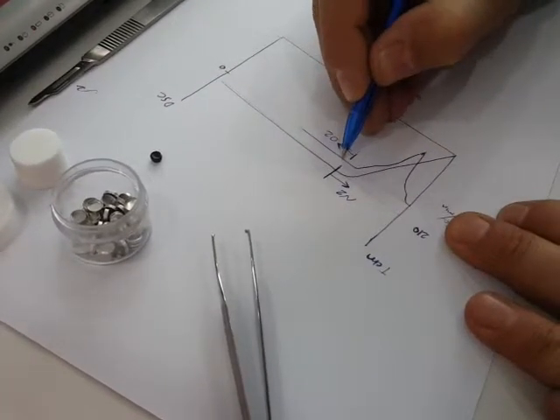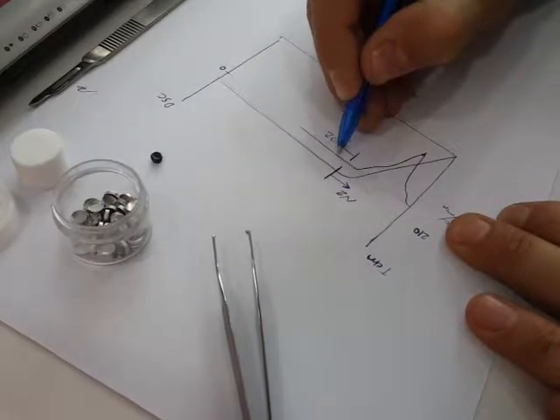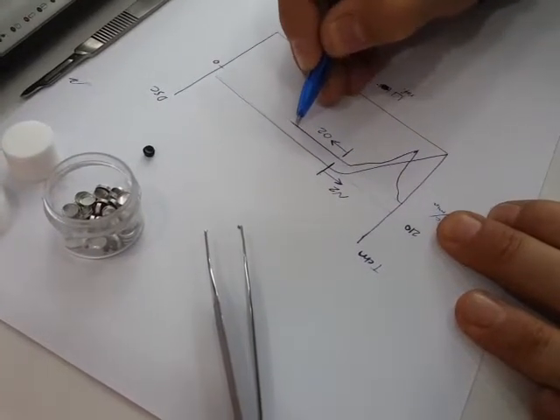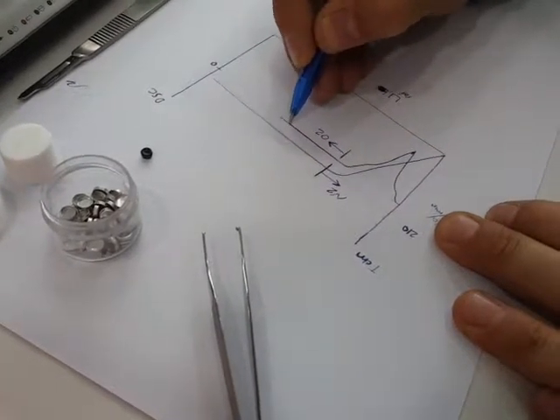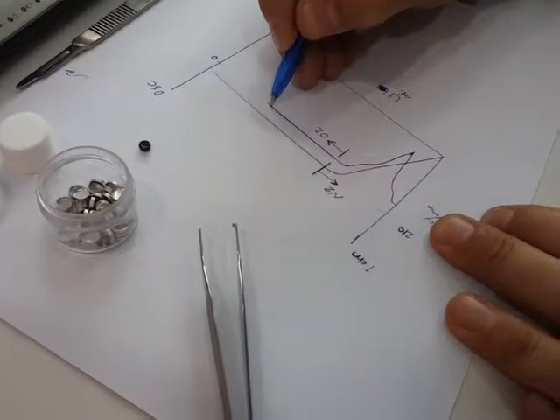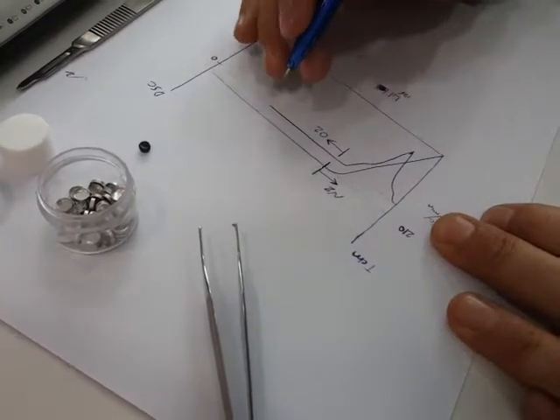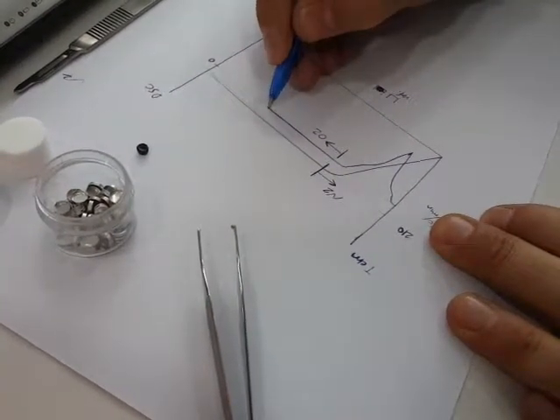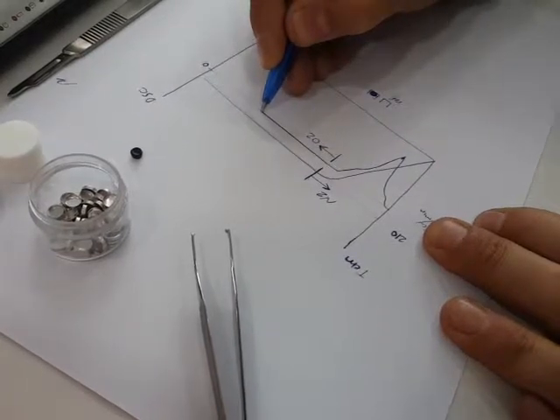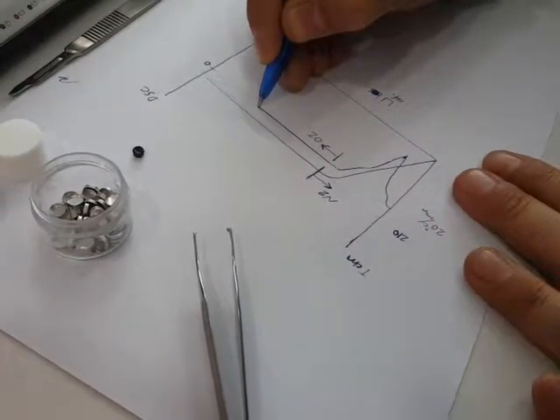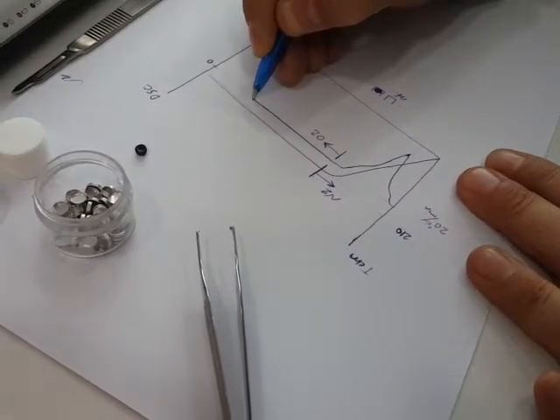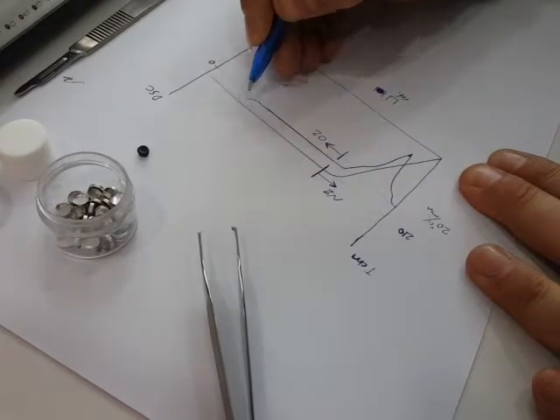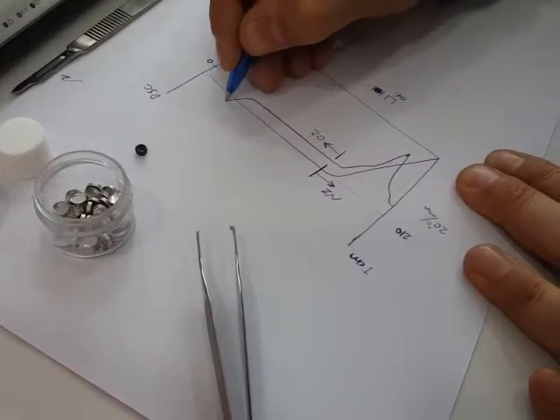In the isothermal section of the graph, the graph will be something near to the zero line, and after a specific time it will break, like this.